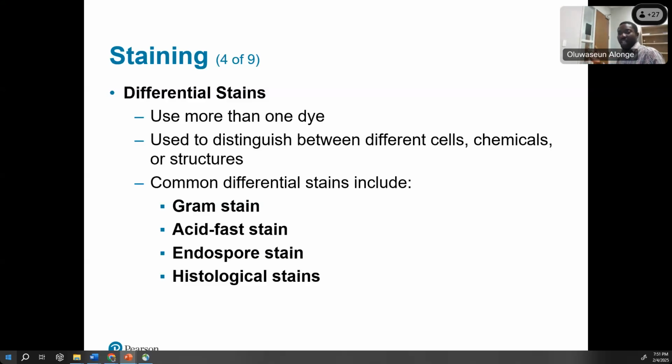Whereas the ones that are gram-negative will not pick it up. Their peptidoglycan is less than 10%, it's limited. It's just like you're saying something is here, but you really can't trace it. That's the way gram-negative are. They have the peptidoglycan, but it's quite small and negligible for the cells to pick up. All right.